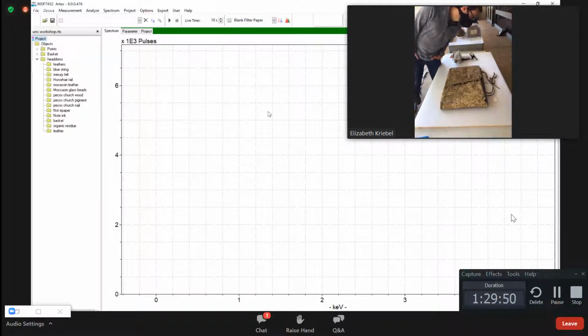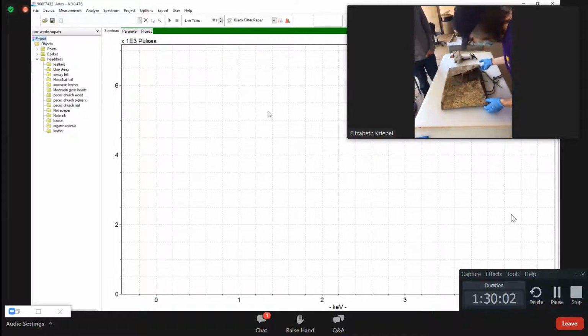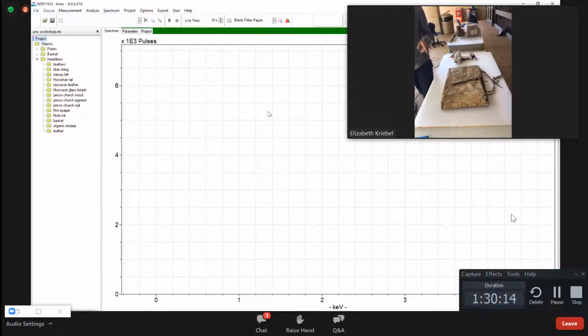Well, let's measure. Is this the exposed wooden dowel or is it wrapped under this leather? It looks like it's wrapped under the leather, right? It's inside, and you can see it through the holes, but this is too stiff to really open. Yep, let's get the leather if we can, and then we'll do a couple of the pigments that are evident. But the one thing to know about this is we're measuring through it, right? So we're going to see multiple layers. If it gets really complicated, or there's anything that seems really anomalous, it might be because there's a pigment underneath the leather that we're probably measuring.